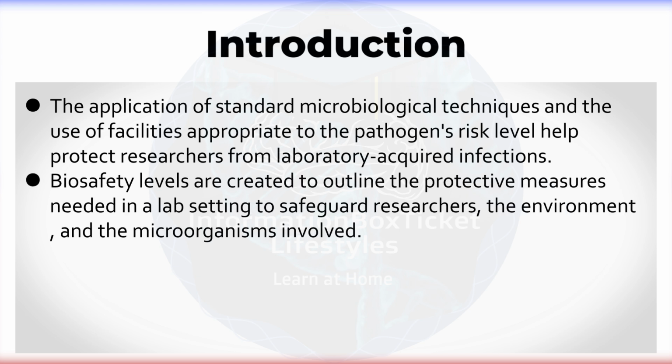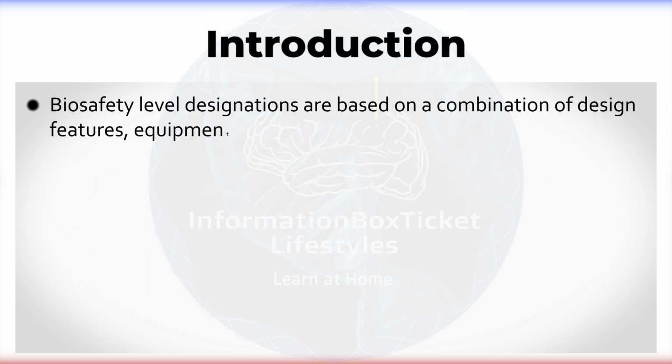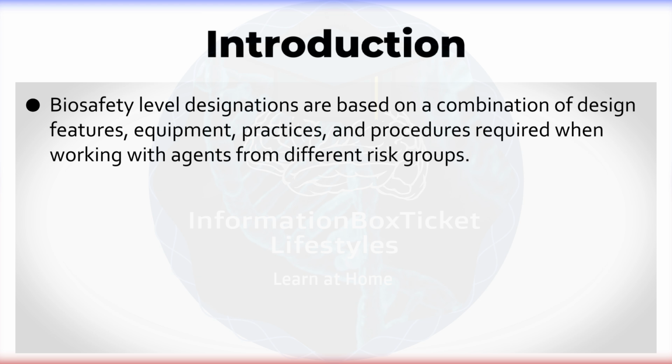Biosafety levels are created to outline the protective measures needed in a lab setting to safeguard researchers, the environment, and the microorganisms involved. These levels are defined by the Centers for Disease Control and Prevention, with each level specifying detailed practices and safety requirements. Biosafety level designations are based on a combination of design features, equipment, practices, and procedures required when working with agents from different risk groups.